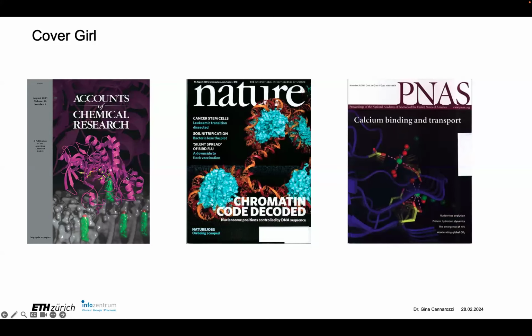So this illustrates a lot of the beauty of PyMol, is that you can change the visualization. Do I want a surface? Do I want sticks? Do I want a ribbon? You can change the colors, and you can add labels. One thing that makes this possible is selection. So you have to be able to select certain parts of the molecule. And once you've selected certain parts of the molecule, which you can do by name or by structure or by type, then you can color it or label it or make it how you want.